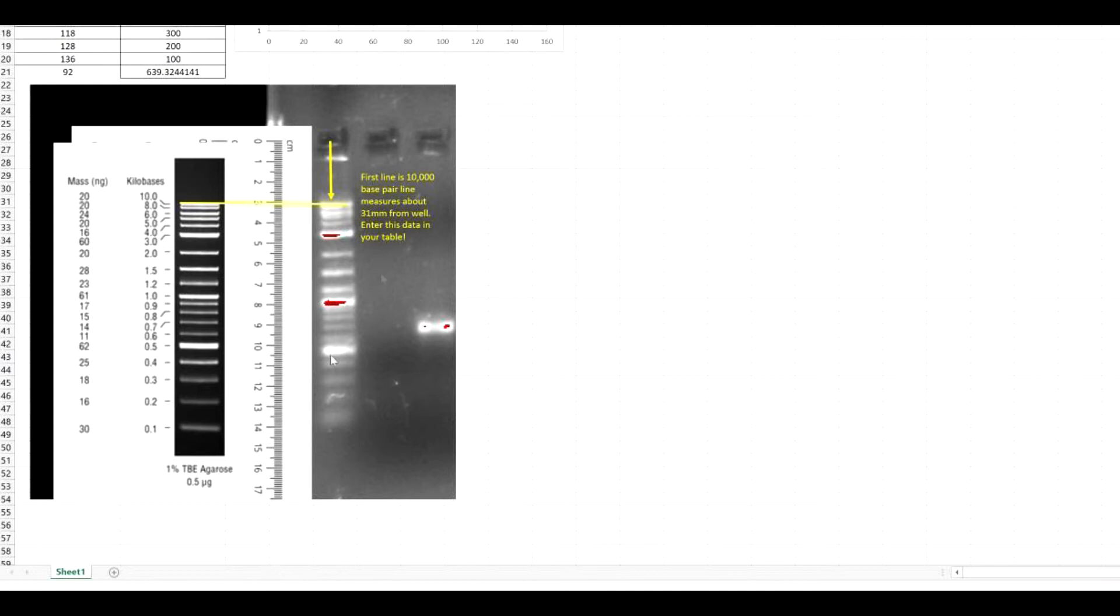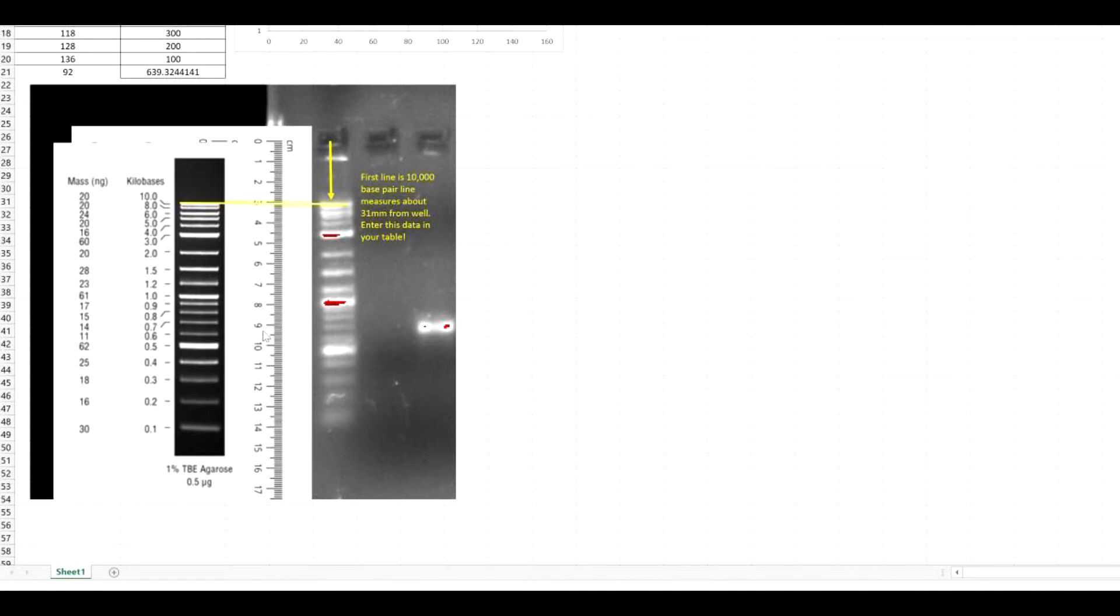This image down here is going to show you, number one, the marker, the NEB 1 kilobase marker that we're working with in this lab. Next to that image, I put a ruler, and you want to make the measurements in millimeters. And in this last part of the graphic is the actual gel image.